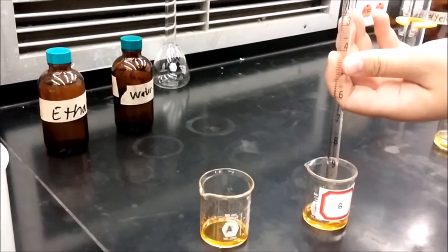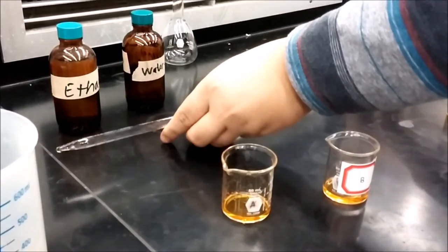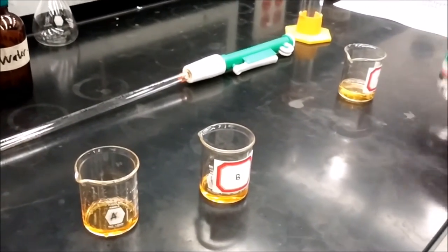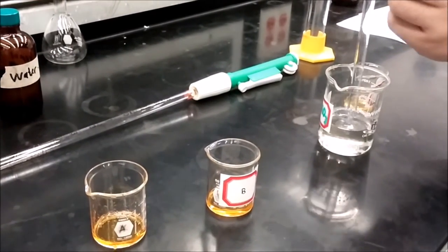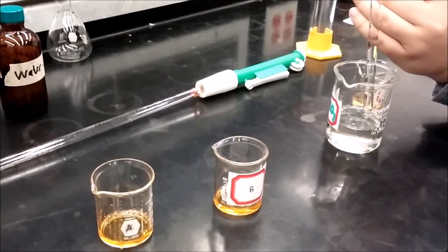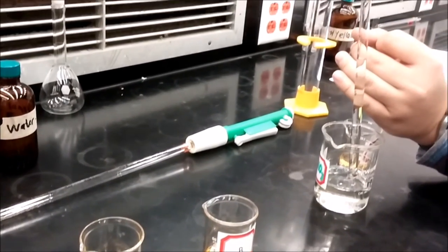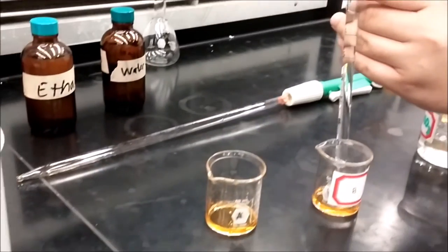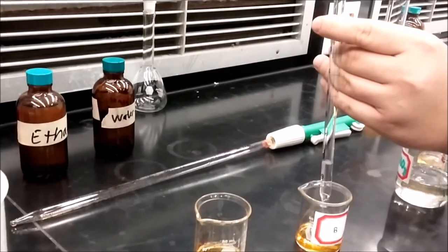Also, use two different pipettes for the 1:1 solution and the dye solutions. You want to use different pipettes so that your solution doesn't become contaminated. Again, take special care when filling the graduated pipette. Be as accurate as possible. Another tip is not to let the very tip of the pipette touch the diluted solution that you're making. Otherwise, it may contaminate the pipette.